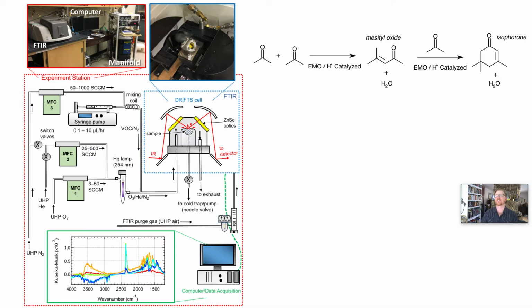And there are certain things that will allow us to see if the gas actually absorbs and sticks. That's mostly related to the fact that cross sections in IR are very small and it's very difficult to see gas phase organics unless you have a very long path length. But also if some chemistry happens, we're going to see evolving spectra. Down here are some examples: positive peaks showing functional groups being created, negative peaks showing functional groups being destroyed. And this was what we hypothesized the reaction should be.